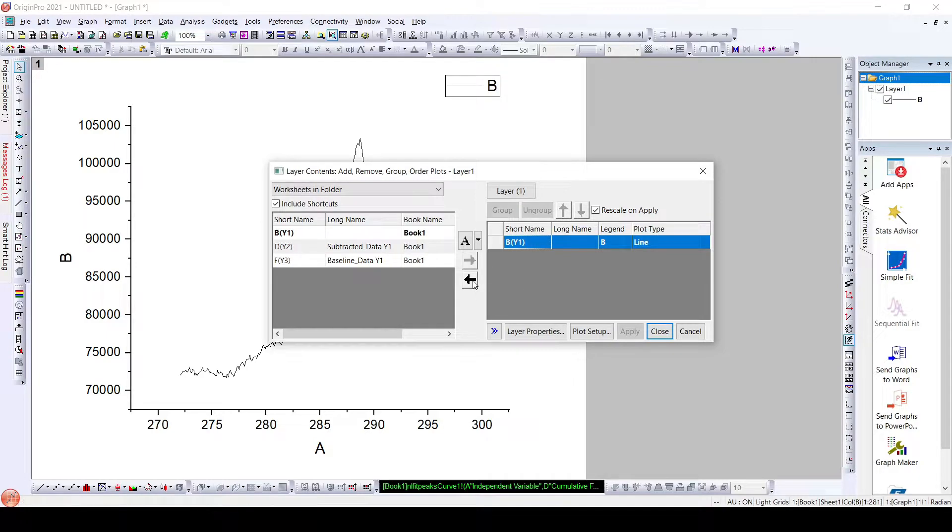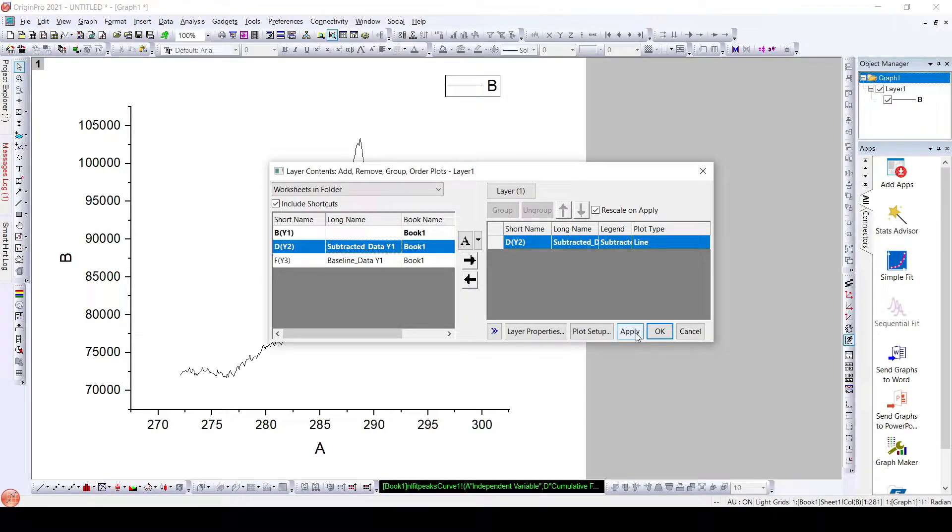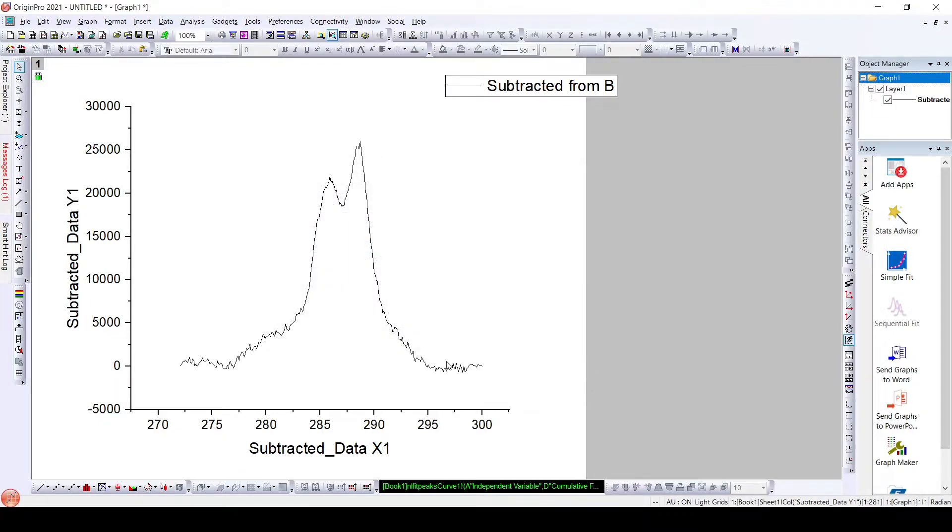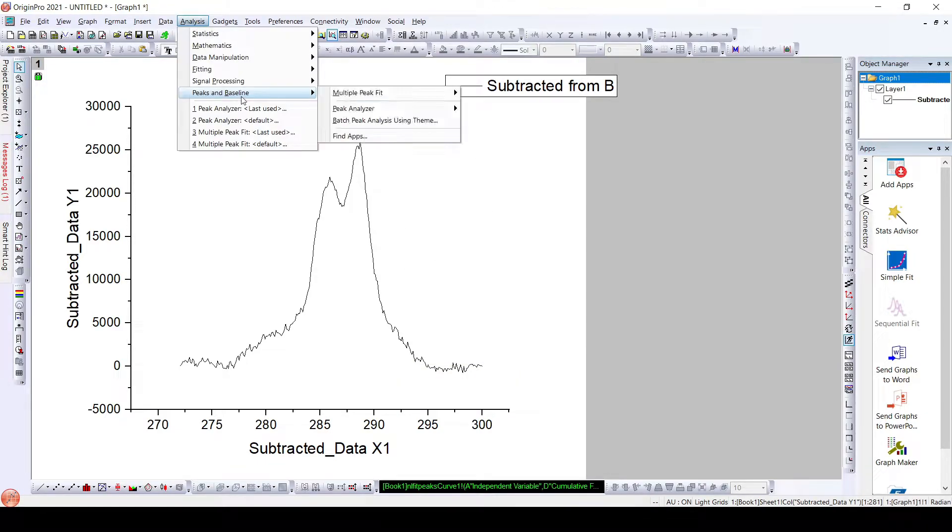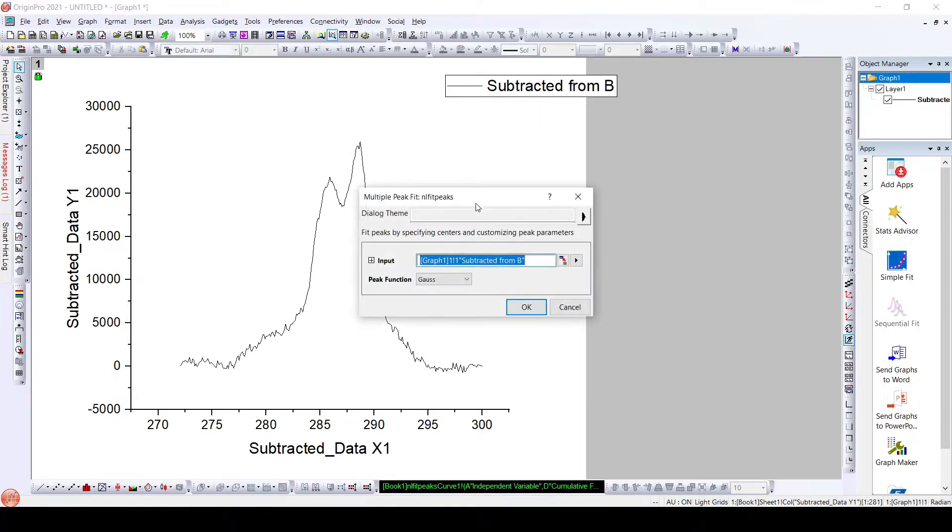Here we have our subtracted data and now we will deconvolute it. For this, go to Analysis, Peaks and Baseline, Multi-Peak Fit. Click Open Dialog.